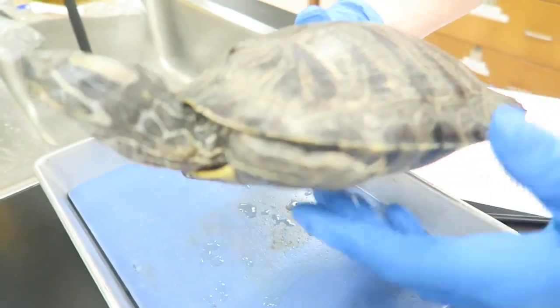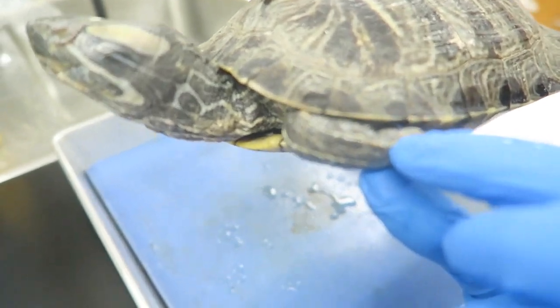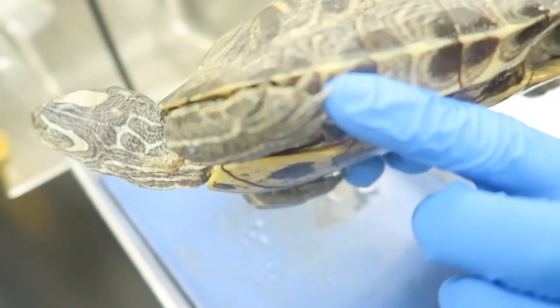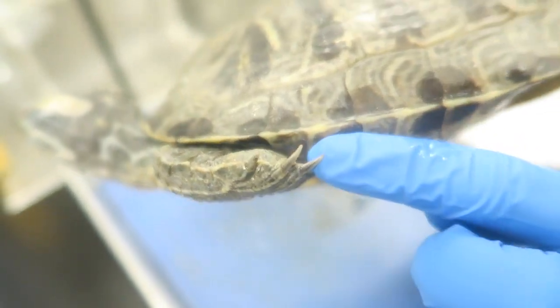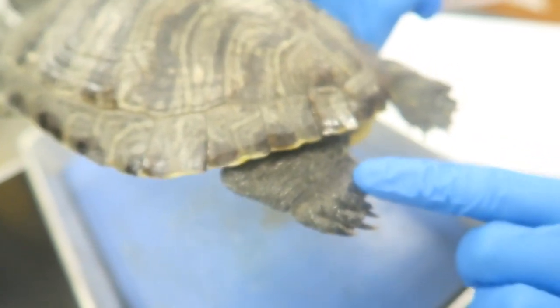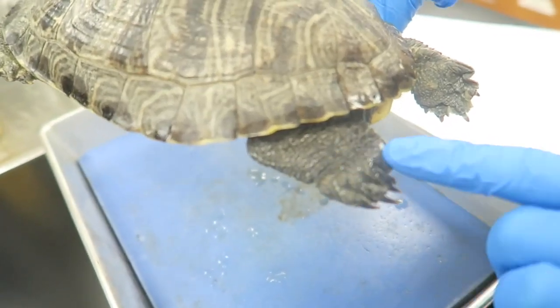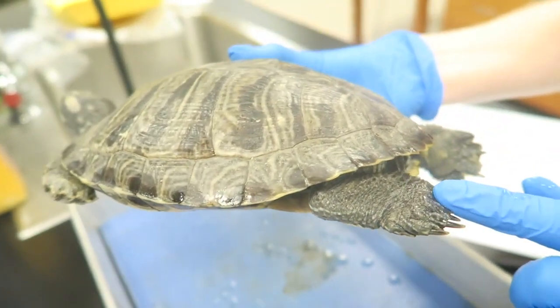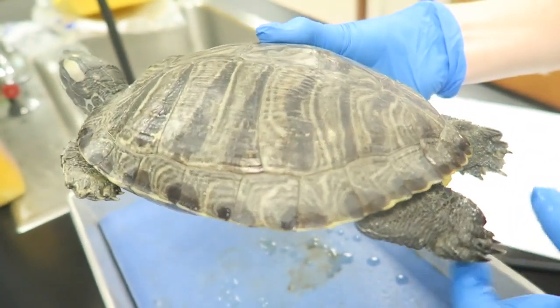The forelegs are covered in scaly skin and they have claws, which allows the turtles to climb, dig, and move. Moving down to the hind legs, which are actually longer than the forelegs, they're shaped kind of like a paddle, which increases water resistance in the water allowing the turtle to swim.